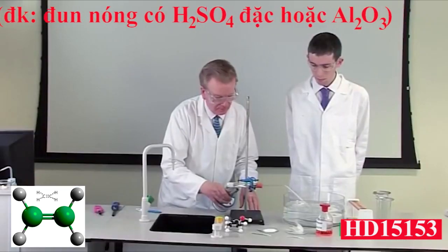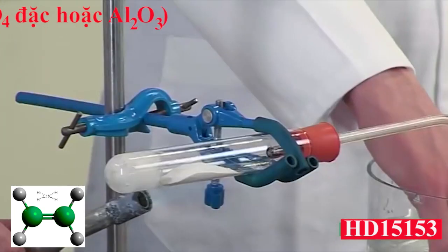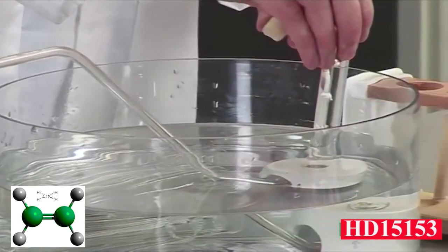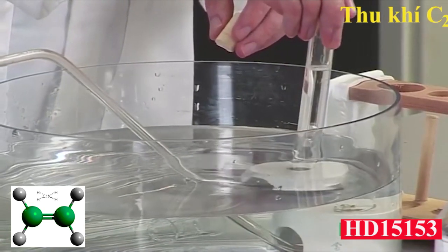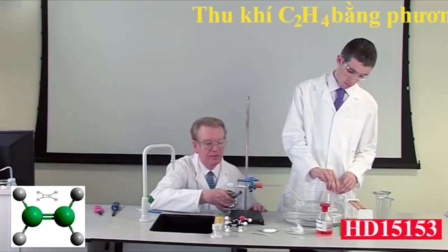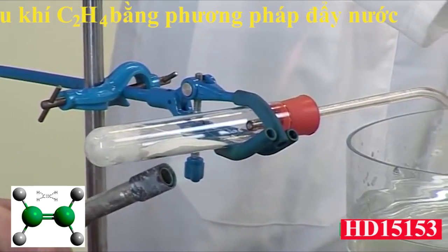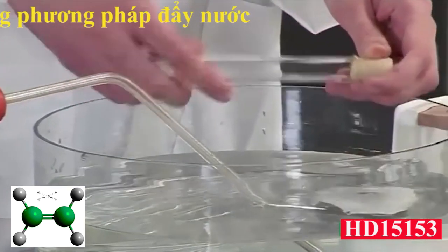Allow the bubbles to escape for a short while, as these are mainly bubbles of air displaced from the apparatus. Collect 5 test tubes of the gas. Put a stopper on each test tube as it is filled.